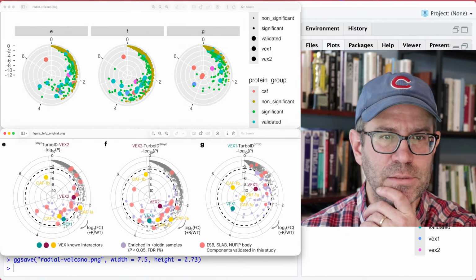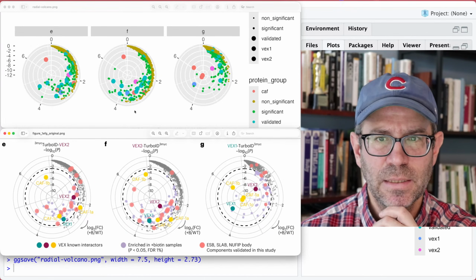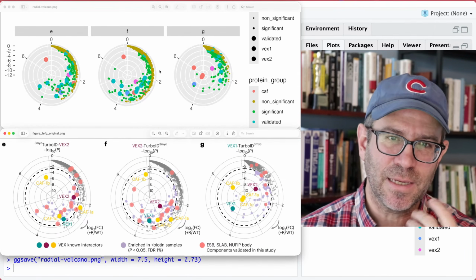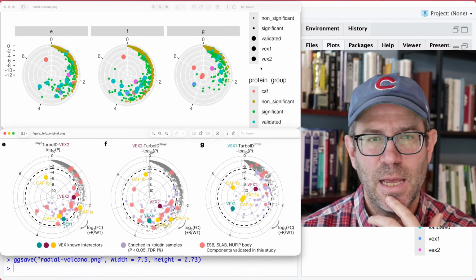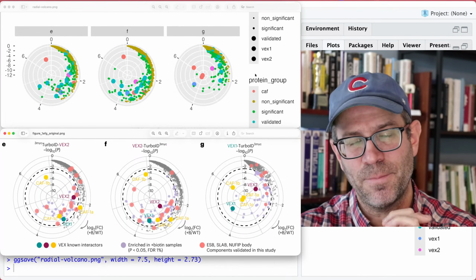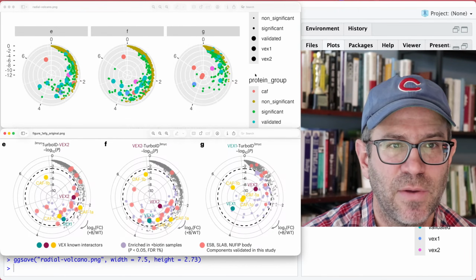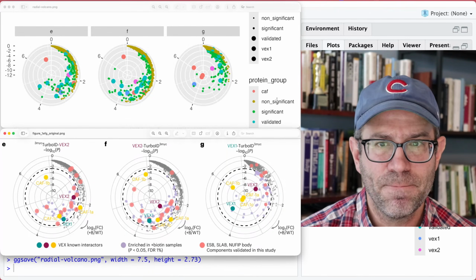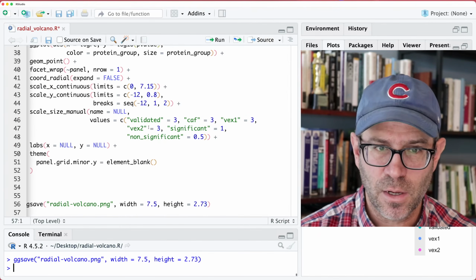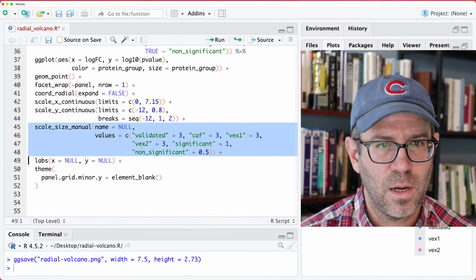And so now we can see that we've got those points. Let me get the color right, and then we can perhaps hide the legend for now. And then we'll let the panels expand and blossom so we can get a better sense of how our sizes are looking. So let's go ahead and turn to the color now. And so for the color, we'll do a very similar type of thing.